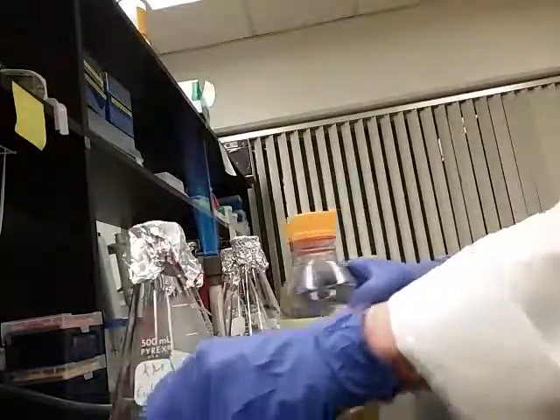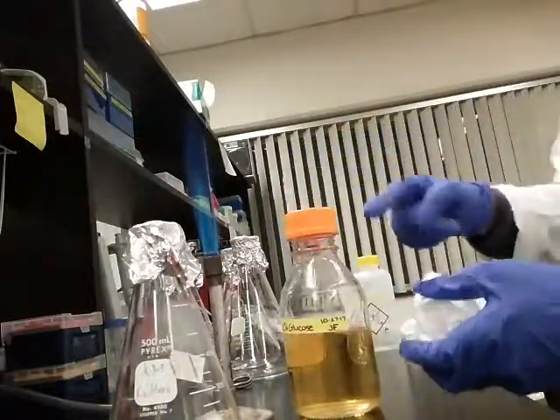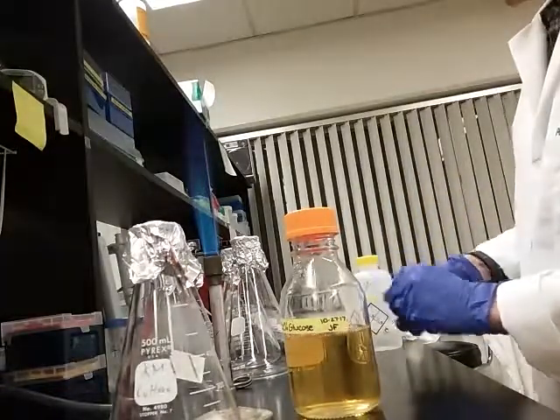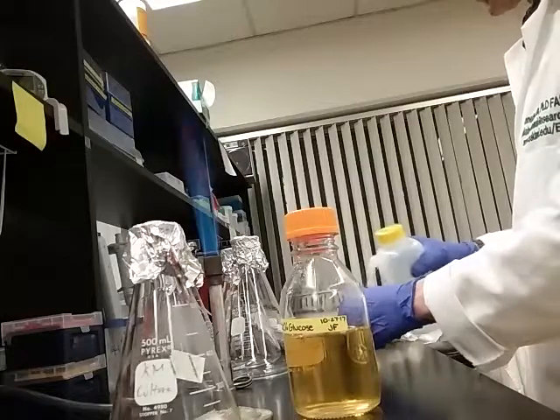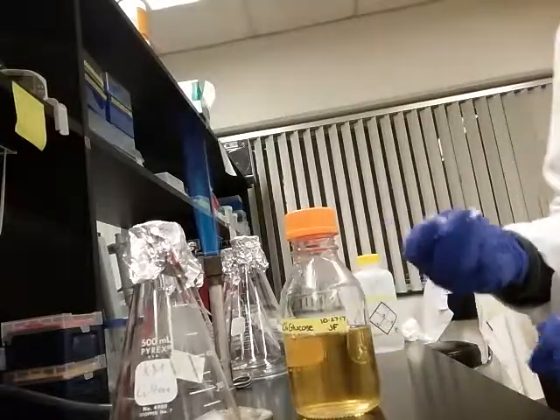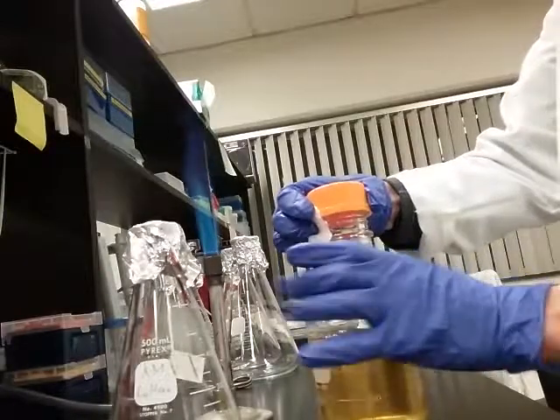This is going to be the media that we're using. This particular bottle has a little plastic ring liner, so I can't flame it. But I can put some 70% alcohol on a kim wipe and turn the cap backwards.